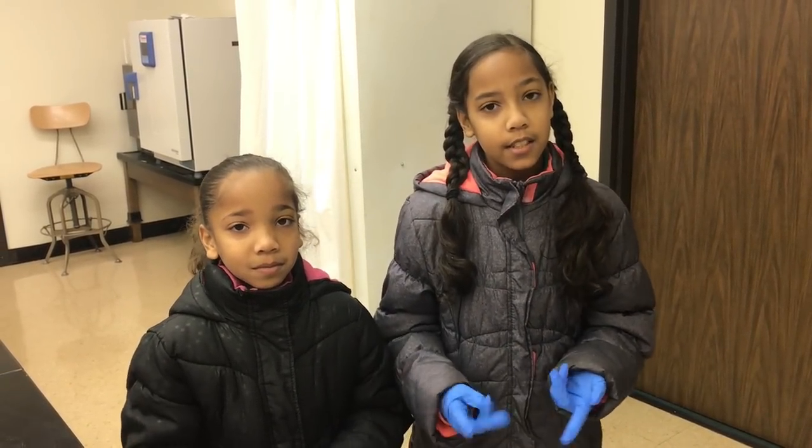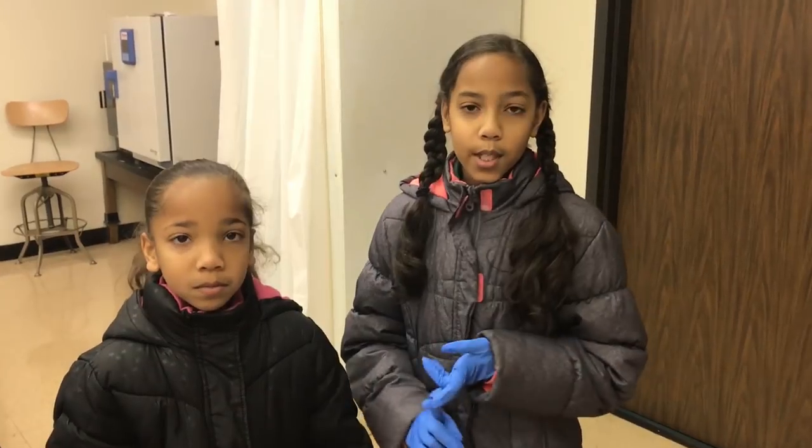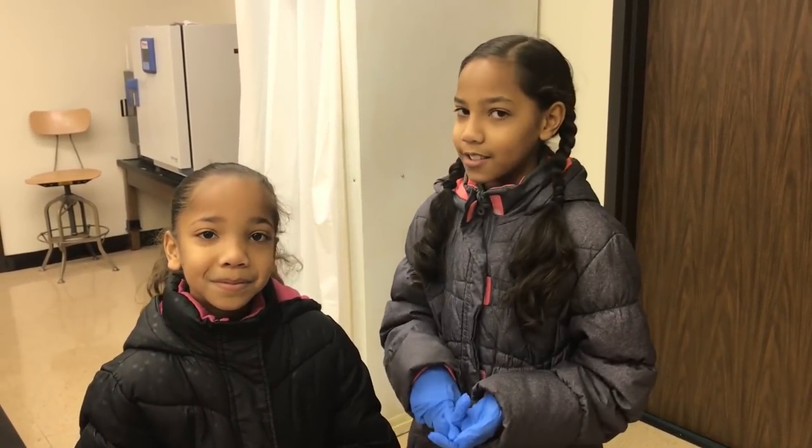Today we're going to be testing two things, total bacteria and a specific type of bacteria, Staph. We're going to test it on keys and lotion since we use those almost every day.